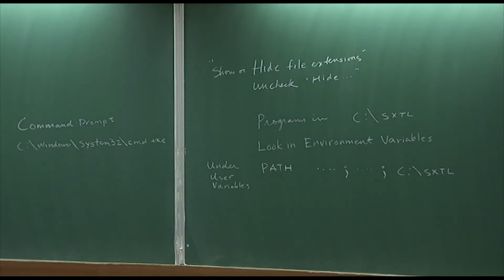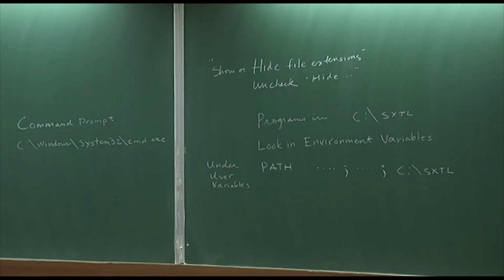So, okay. So play around with that a little bit, and then be sure and bring your computer next time. We'll see if we can go through some easy refinements maybe, and then maybe some more difficult ones. We'll have to pick some out for you. But just as a preview, some of the things that you encounter that you're going to hate are disorder and twins. And I think disorder is more common than twinning, actually.